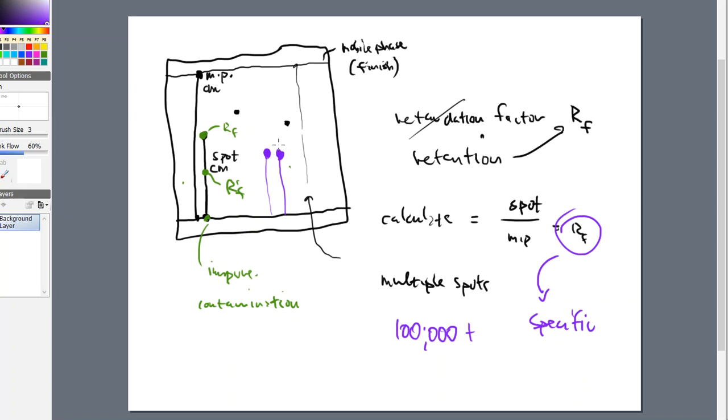We do other tests in a lab. TLC is just one of those confirmation tests, and then we can turn around and do things like boiling point, solubility, and density, and I can run it on other pieces of equipment as well. All right, so that's a little bit of intro to TLC.